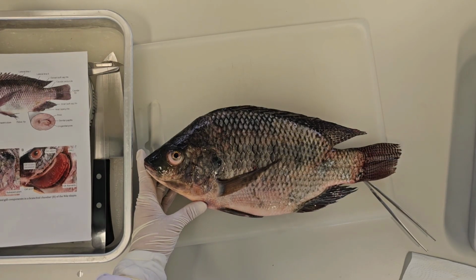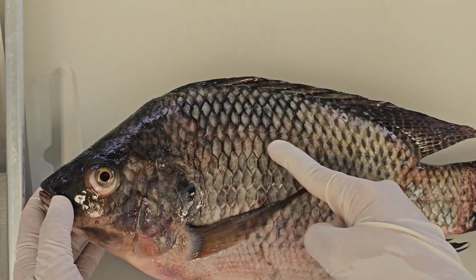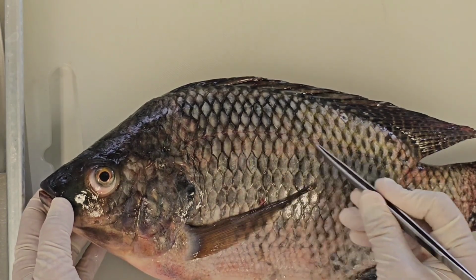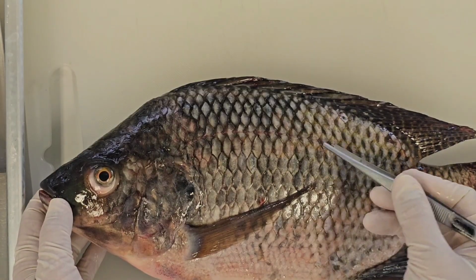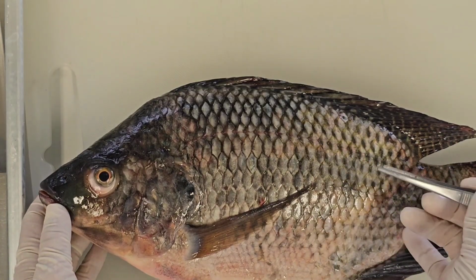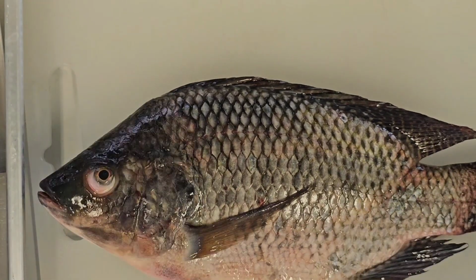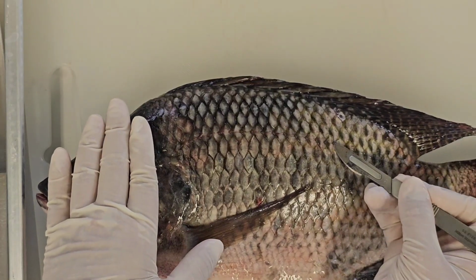Then you can see the structure of the lateral line along the body. So you can see the first one and the next one. I will try to get the scale from the lateral line and compare it with the scale in the other part, and let's see what the difference is.